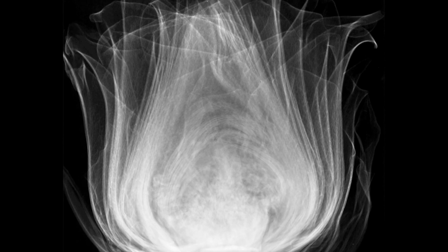In the dark areas of the picture, there was nothing in the way of the X-ray. Lighter colors mean that the X-ray was weakened by traveling through material. The more stuff the X-ray passed, the lighter the pixel in the image.